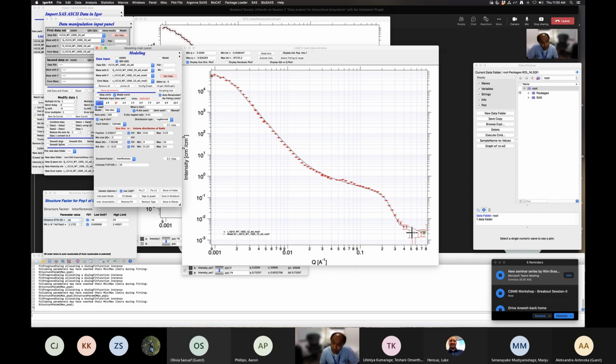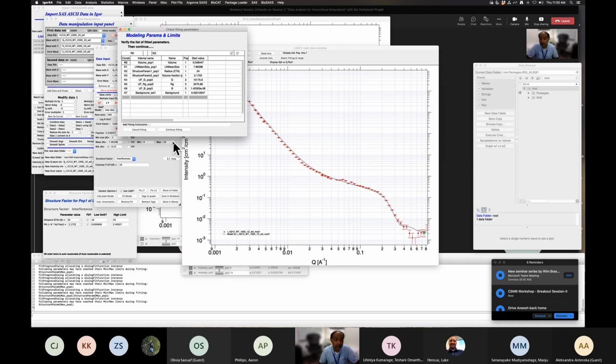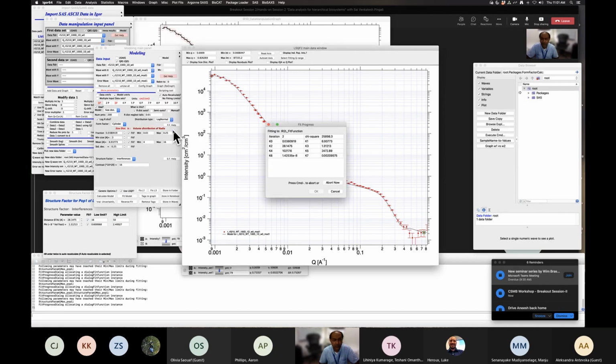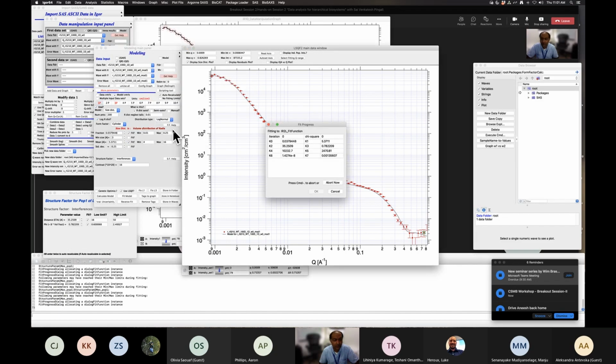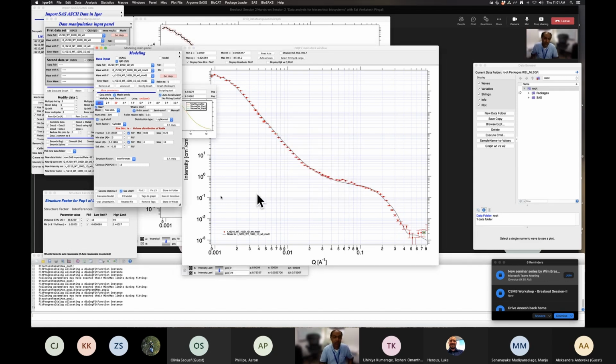So right now it looks like there's very little data where the oscillation tries to come up. So it's sort of not able to resolve this distribution because of that. So we just need to fix it for now. And then I think this distance may settle down better. Still not able to capture that. It's continuously moving. So we need to play with this a little more to figure out where it catches well.